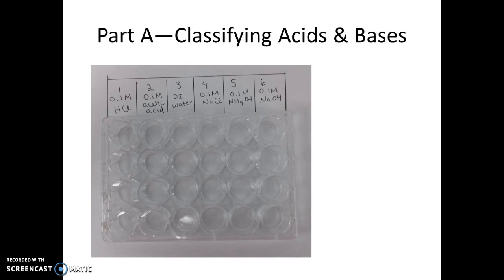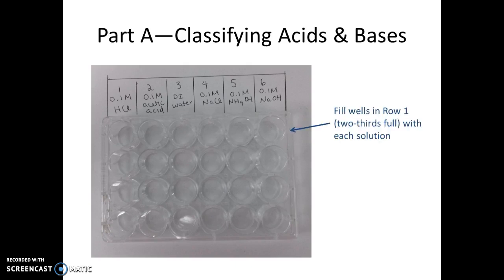Label the columns with the six different solutions that you're going to be testing. The specific solutions are listed in the procedure for the lab, as you can also see from my labels here. Next, fill row one two-thirds of the way full with each solution.